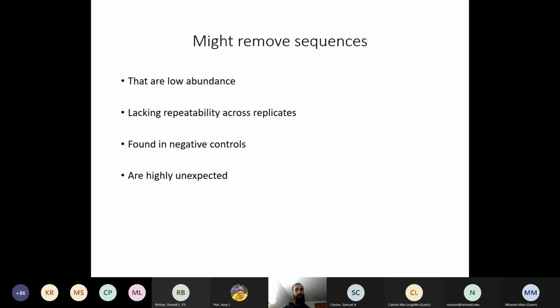And this extra interpretation step often comes because of taxonomic assignment errors or database issues, or it might simply be the fact that we tend to get low abundance or infrequently sequenced sequences that are unreliable when we're using these metabarcoding approaches. And so it's typical to go through your species inferences and potentially remove those that are suspect for various reasons. It could be that the reads for these sequences are very low abundance, which suggests that they are contamination or crosstalk between your different sequencing libraries.